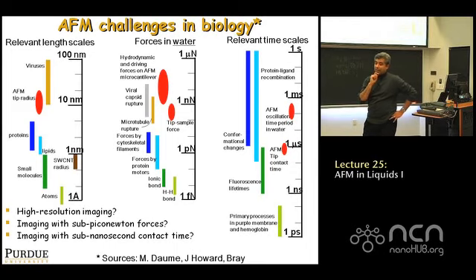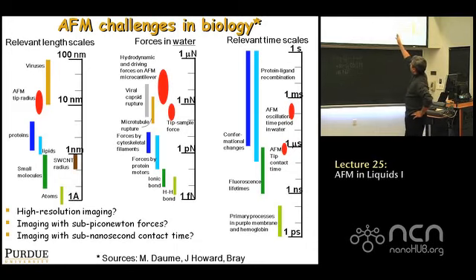I think we mentioned this when we did artifacts. We had a lecture on artifacts and FZ curves. We talked about this. But it's a big effect in liquids, the hydrodynamic drag. And it's often, as I said, of the order of hundreds of nanonewtons, depending on the speed at which you approach.